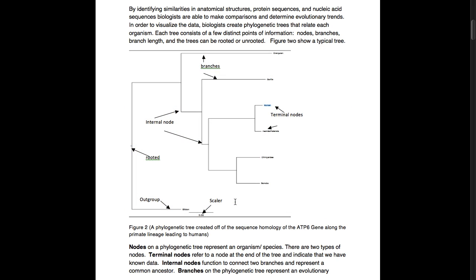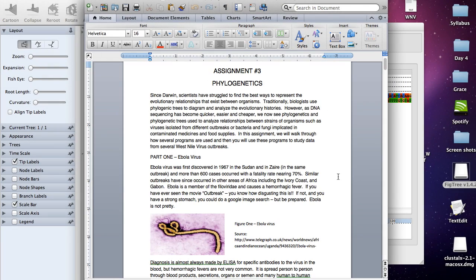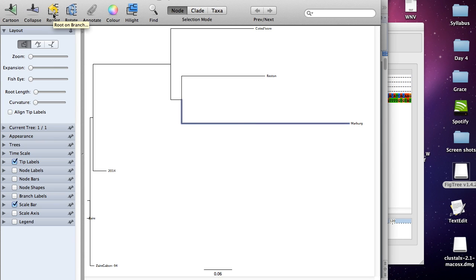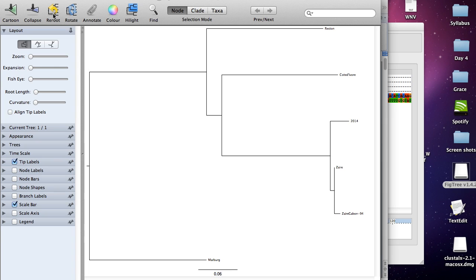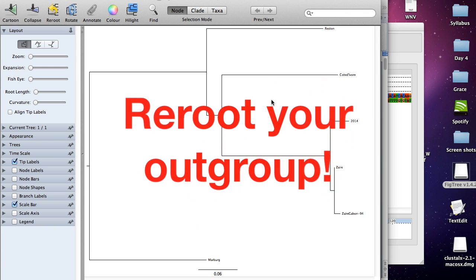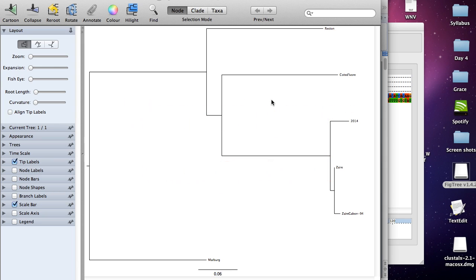Now going back to our tree, our outgroup here is the Marburg virus. What you want to do is reroute this so it looks like this. So now you can see two distinct lineages: the Marburg virus, which is the outgroup, and this group that we're studying, the Ebola virus group. Make sure you remember to reroute your outgroup. This is the number one mistake on this assignment, so please please please do not forget to do this.